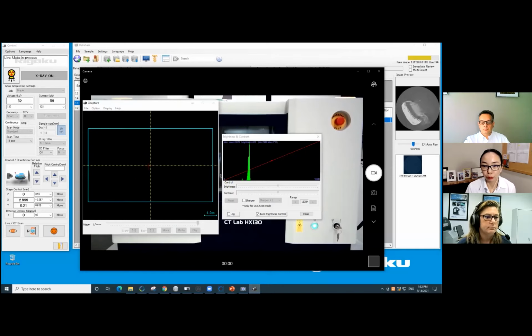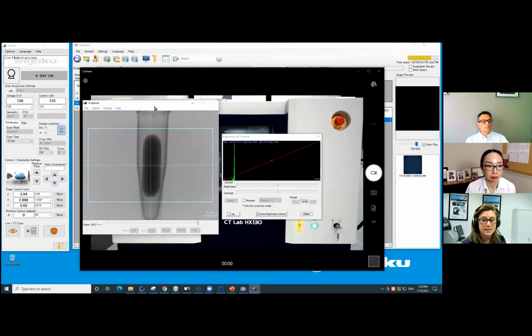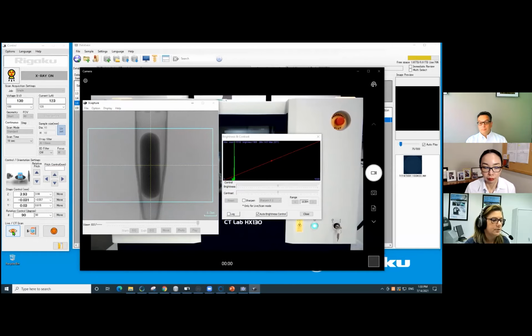And I suppose you know the time scale for the sample change in this case, right? I do. So this is something we've done before. In that same webinar, webinar 3, I talked about 4D measurements, or these time resolved measurements as well. So you can refer to that one. I'm just going to center. It's not so important to be right in the middle because it's definitely pretty small compared to the large field of view, but we're going to look at the whole thing. So just going to move us back to 0 degrees.